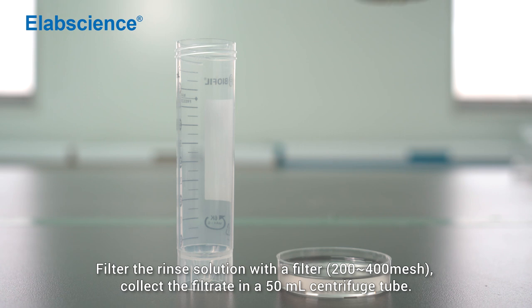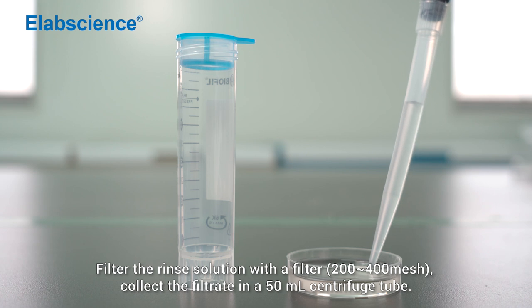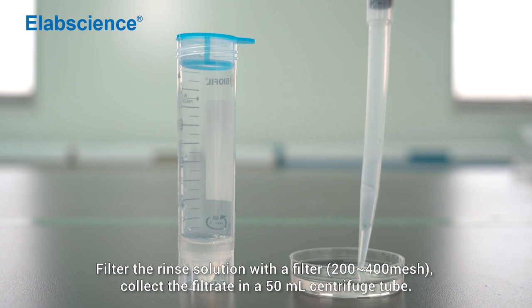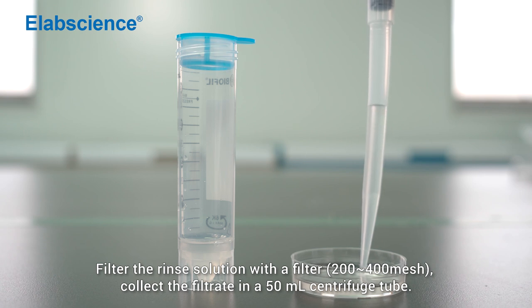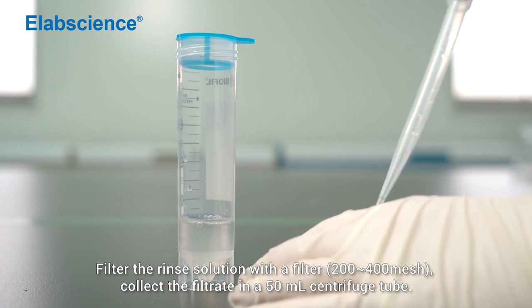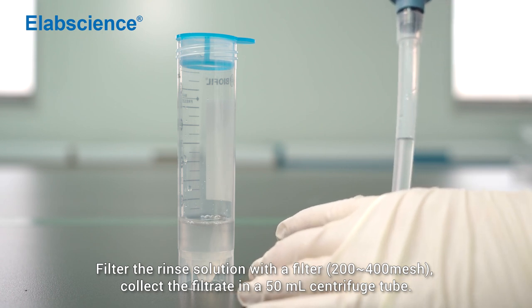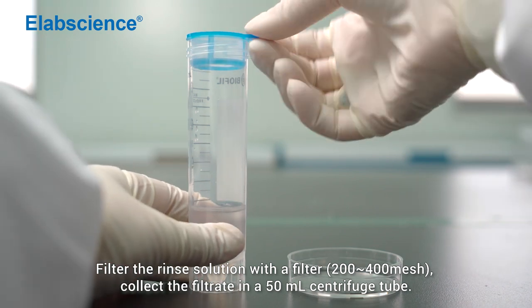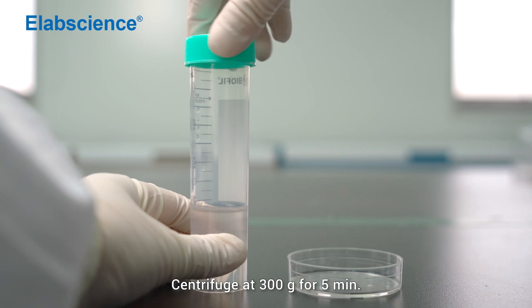Filter the cell suspension with a filter and collect the filtrate in a 50 mL centrifuge tube. Centrifuge at 300 times gravity for 5 minutes.